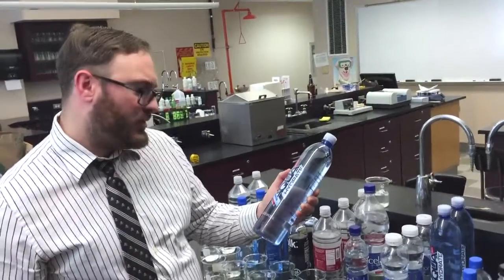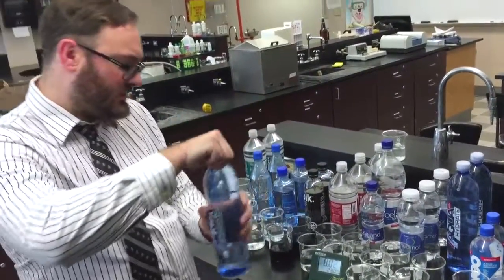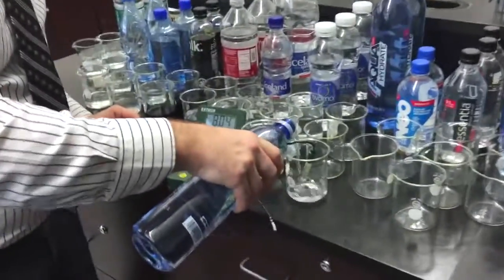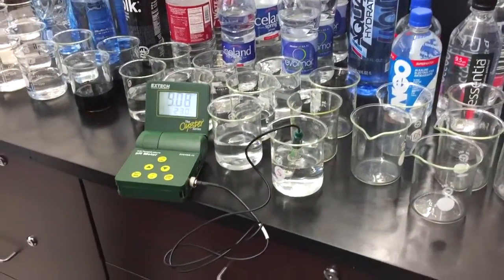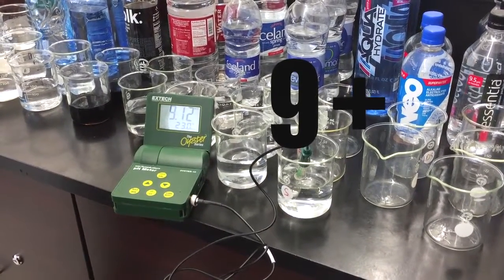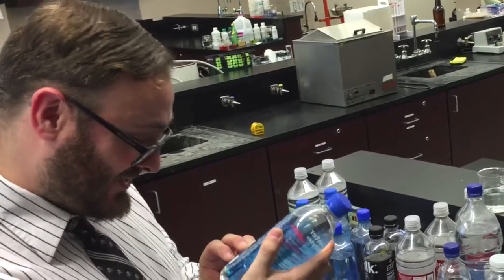The next bottle up is Aquahydrate. It's advertising a pH of 9 plus, saying it's with electrolytes and great taste. So we crack the bottle open and let's see where its pH or alkalinity actually falls. We are at 9.1 and climbing, so definitely at their pH of 9 plus. Potassium hydroxide and sodium hydroxide — we have to be careful with those in the lab because they can actually burn you, being strong bases.